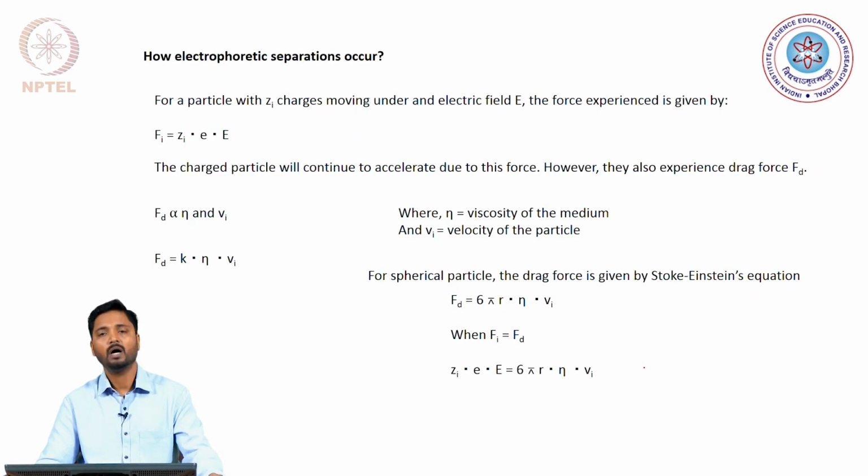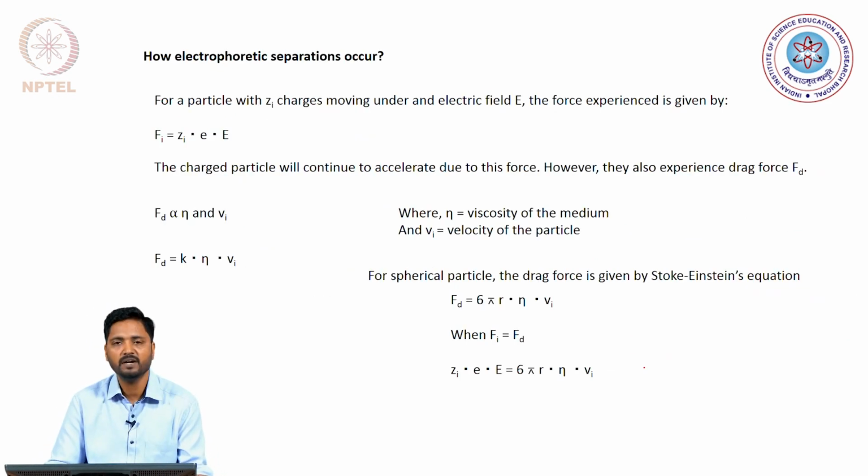Now, the principle by which the electrophoresis separations occur is provided here.